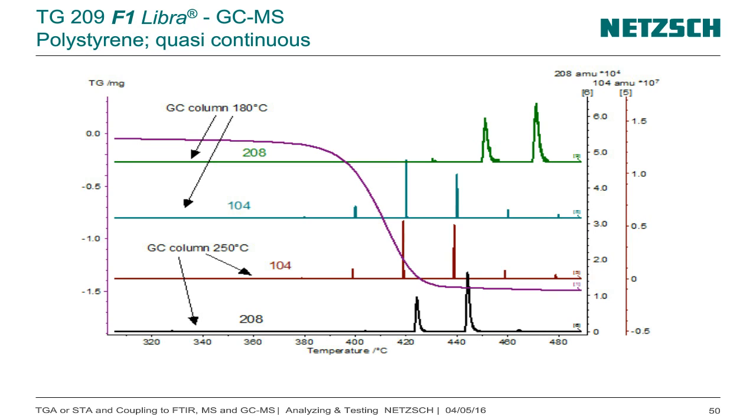It would be better to show it in a 3-dimensional way, because all what you inject at the same time needs different time on the column, but is the gas concentration and gas at this time. And we are working on this, but at the moment we only can show it 2-dimensional.